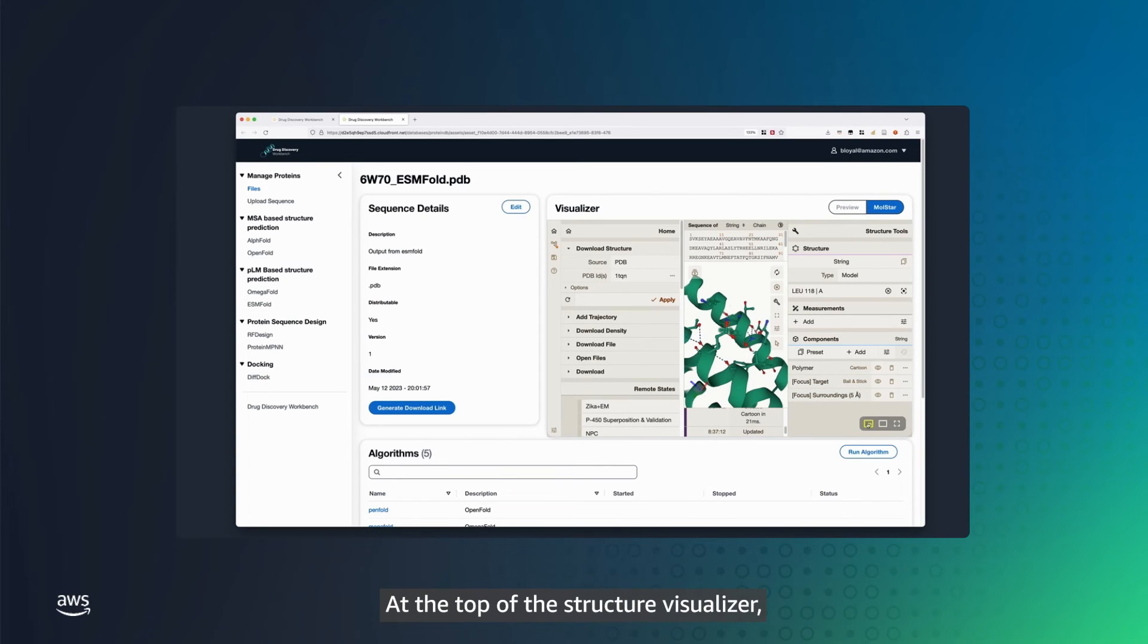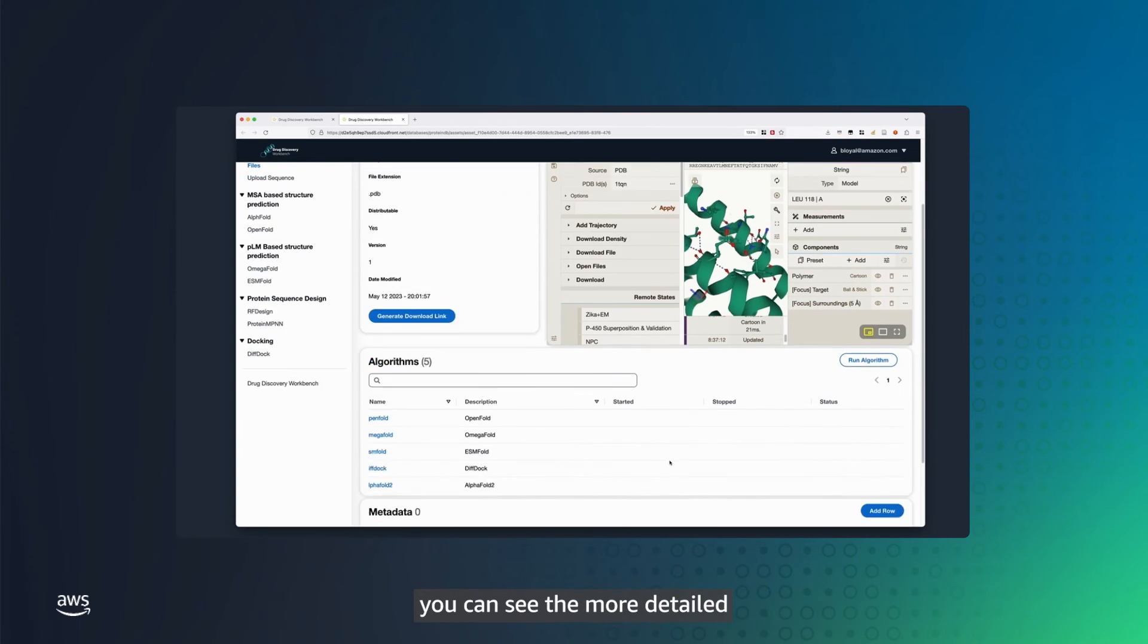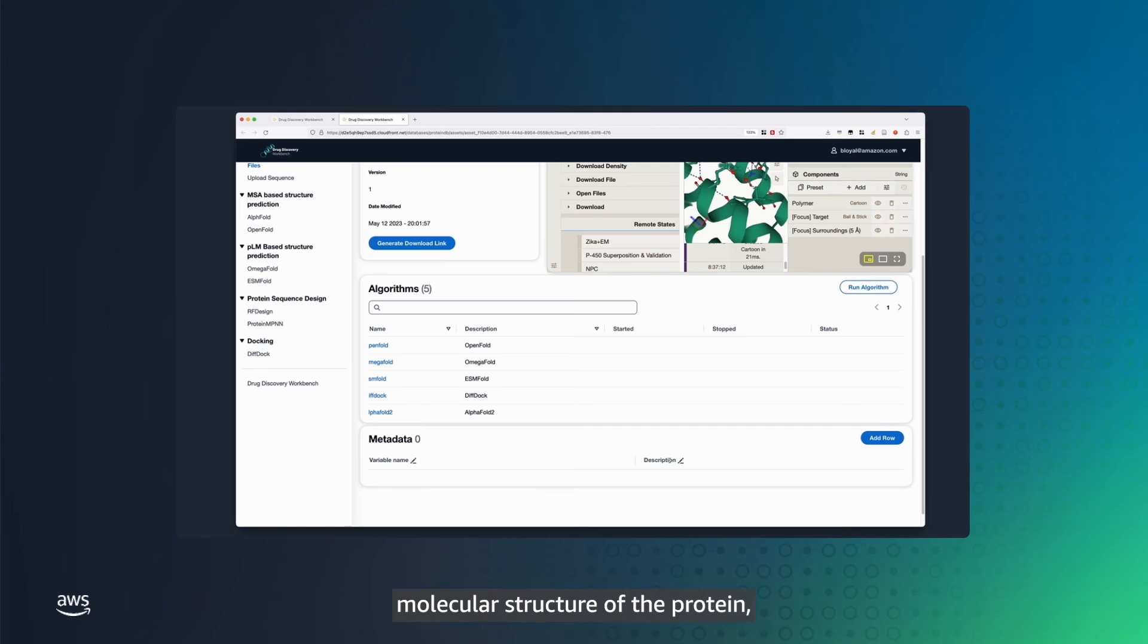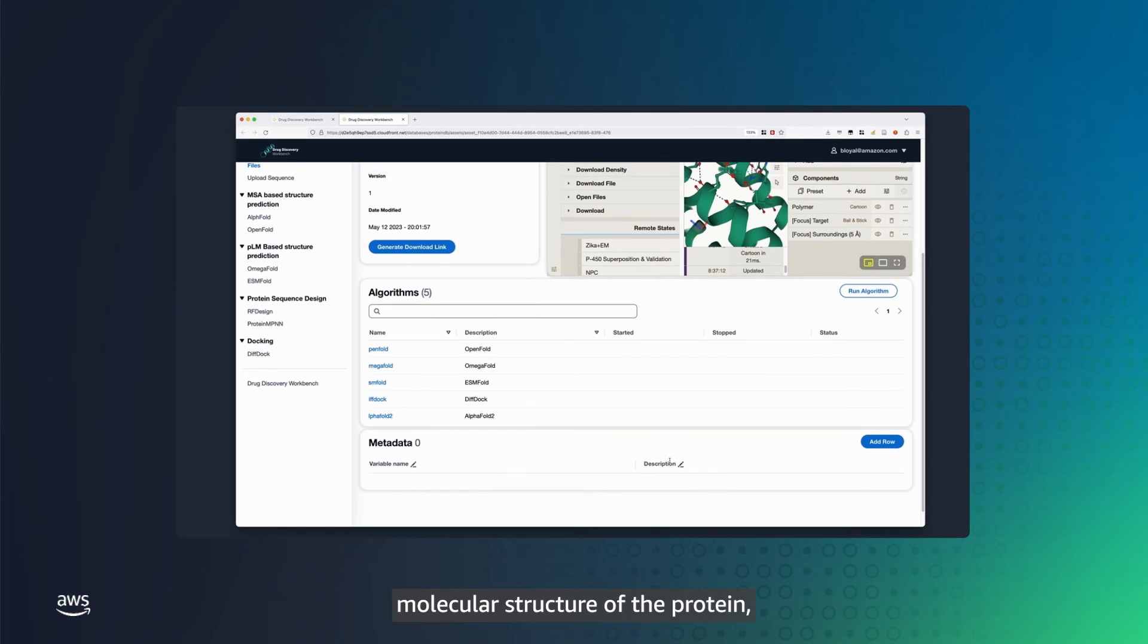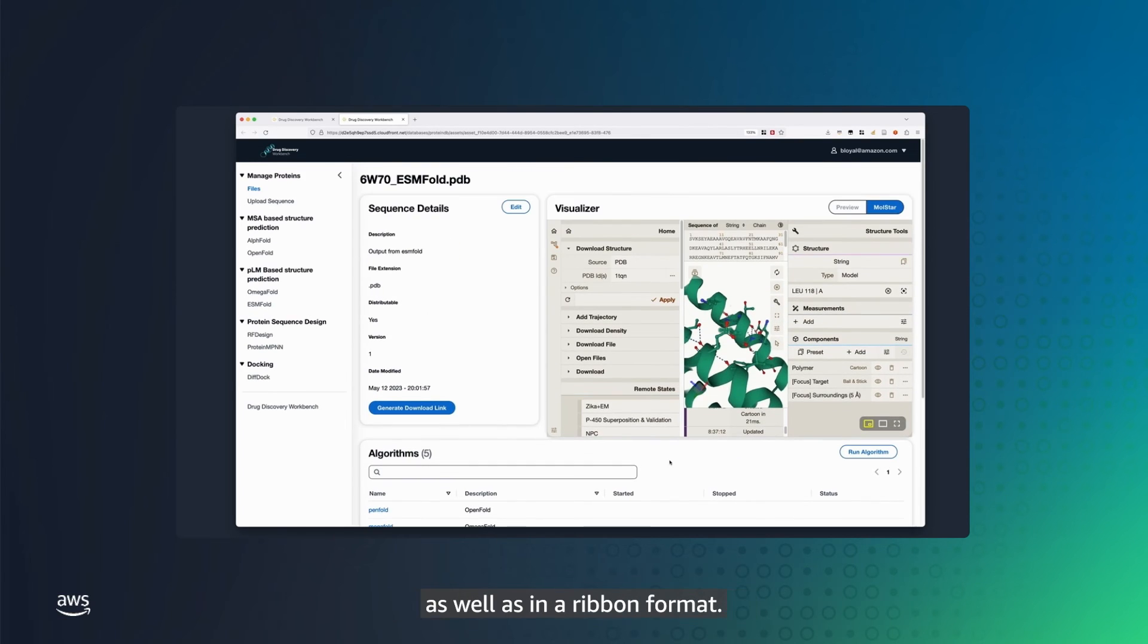At the top of the structure visualizer, you can see the more detailed molecular structure of the protein, as well as in a ribbon format.